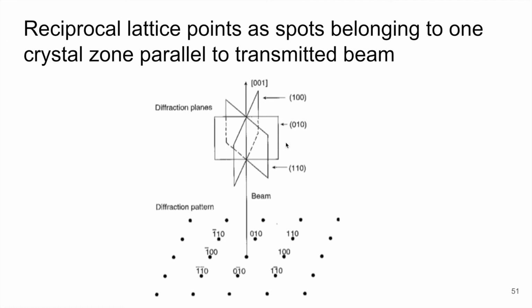This is a real central part of diffraction in TEM, that we only see diffraction from those that are members of the zone, and this tells us that the orientation matters, right? So even though XRD or just general diffraction would tell us we have a certain number of diffraction planes, only those that are in the right orientation, governed by the Weiss zone law, will diffract.